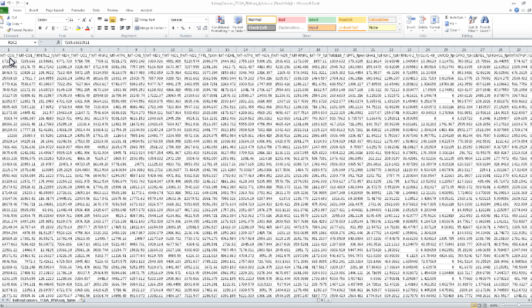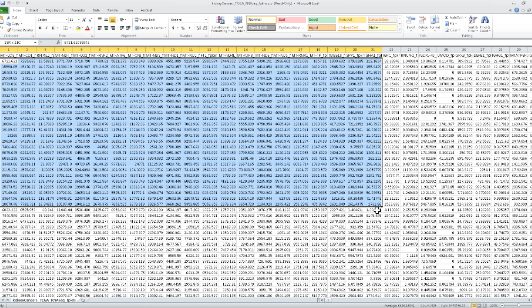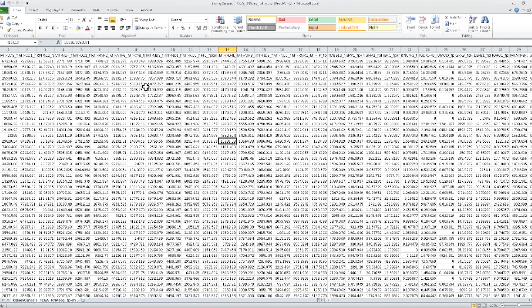So column A and B, you can have columns in Cytobank that are non-numeric when you upload it. However, you'll have to leave those out of the data. We end up converting all subsequent columns into this FCS format, and that ends up throwing a wrench in the works if you have text in one of the columns.